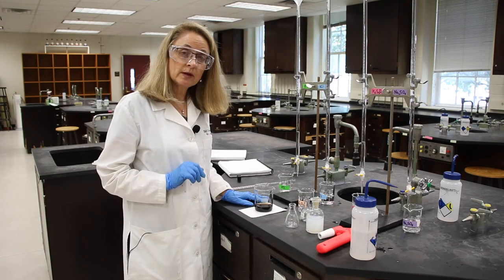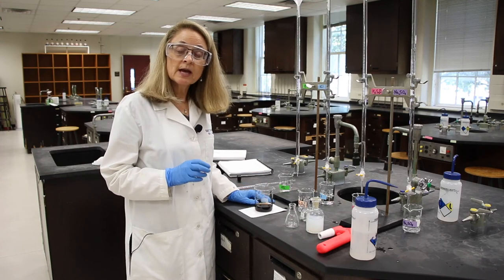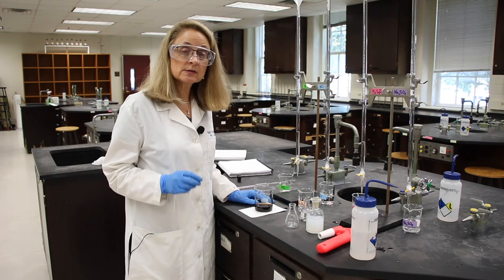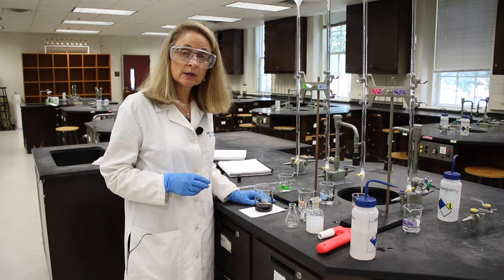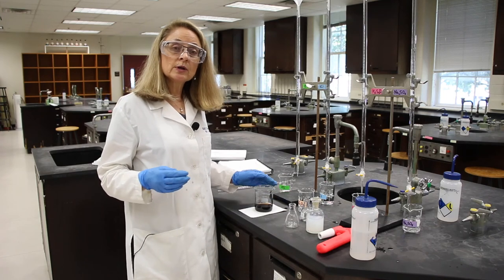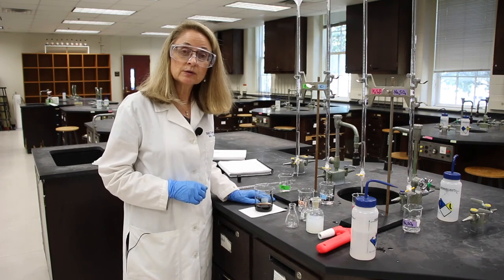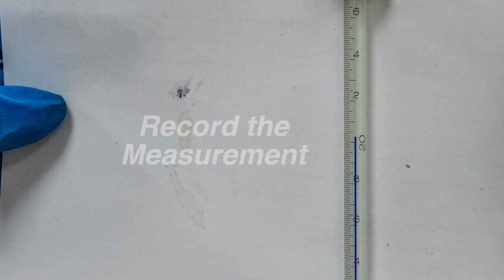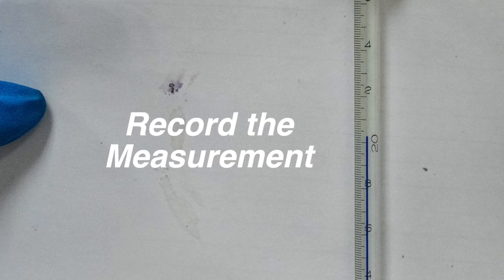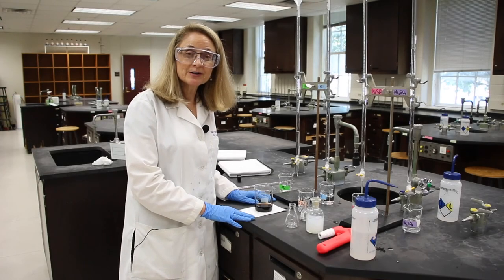One more thing before we leave this experiment is every rate of reaction experiment has a temperature associated with it. Often we don't use this in our calculations. There are some which we can use that temperature in, but you need to always state a temperature when you are doing a rate of reaction experiment because the rate is dependent upon temperature. I'd like you to read the temperature now. Thank you for being my lab partner.